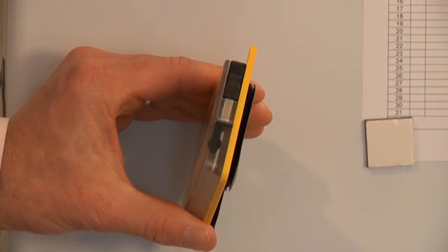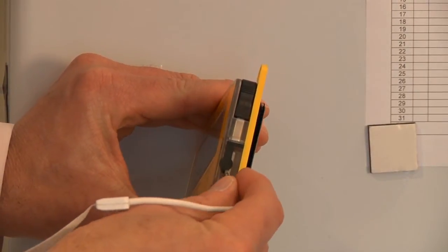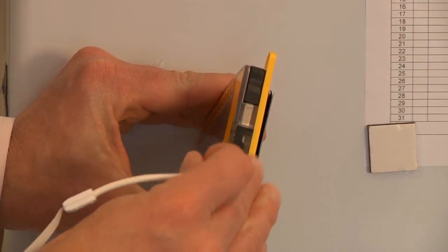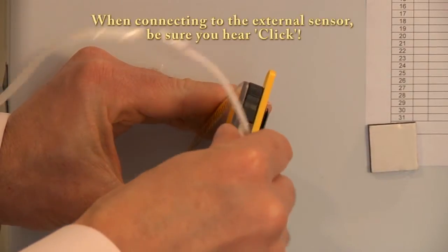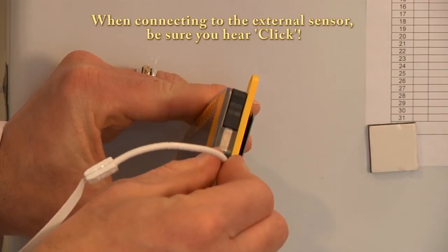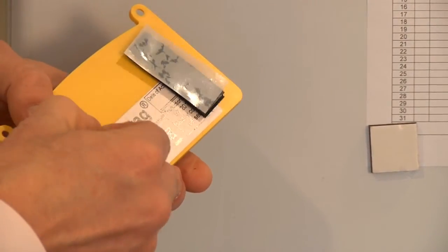Now we are ready to attach the external probe to the data logger. Be sure to listen for the click. Remove the Velcro tape.